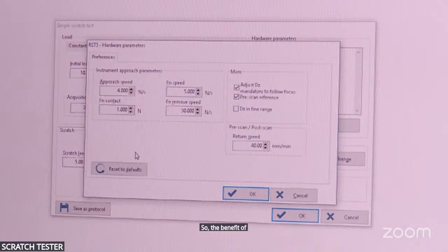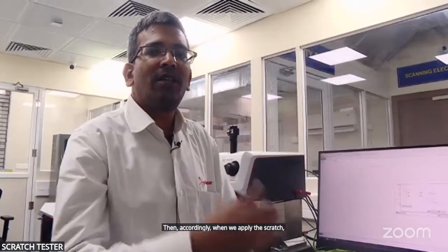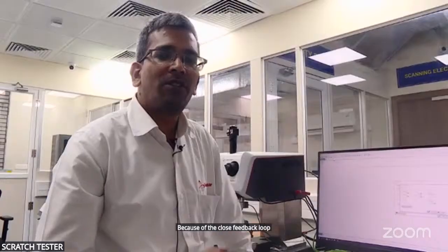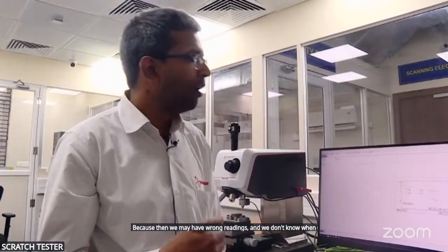The benefit of having this is, say we have a very rough sample. While doing the pre-scan, we have already scanned the ups and downs of the hills, or if we have a curved surface, what the curvature is. Then accordingly, when we apply the scratch, because of the closed feedback loop, our force will be maintained constant, which we want. We don't want our force profile to move with the curvature, because then we may have wrong readings and we don't know when exactly the peeling or delamination happens in our scratch.